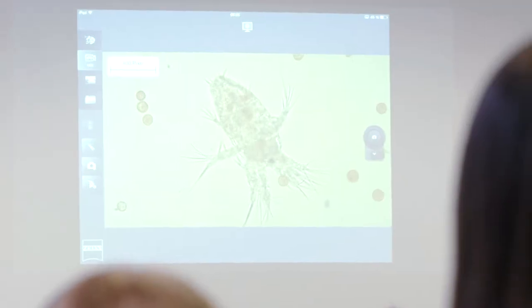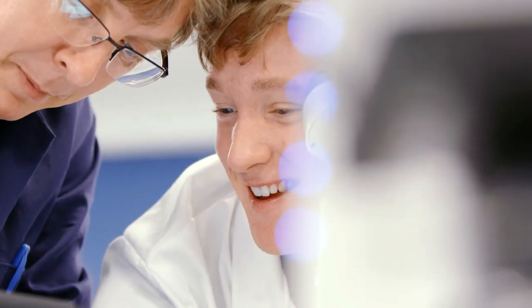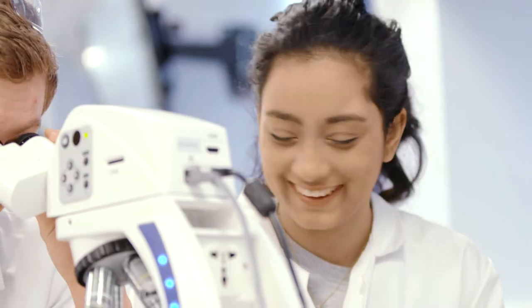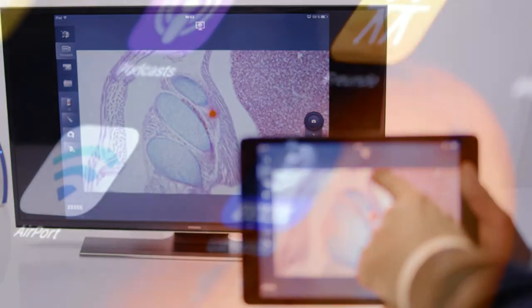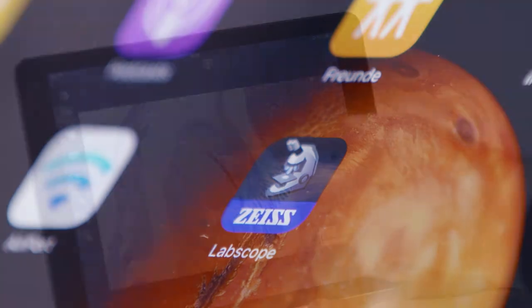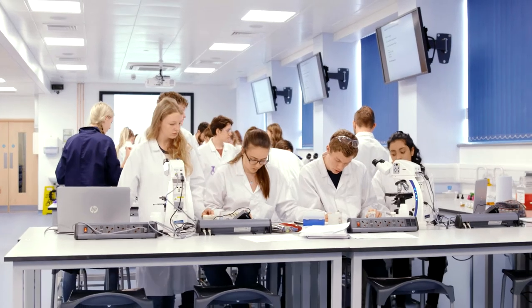Use a projector to grab their attention and point them toward tiny structures and interesting details. Now you can do all that using the laser pointer function in SAIS Labscope to enliven traditional teaching with exciting techniques for classroom experiments and demonstrations.